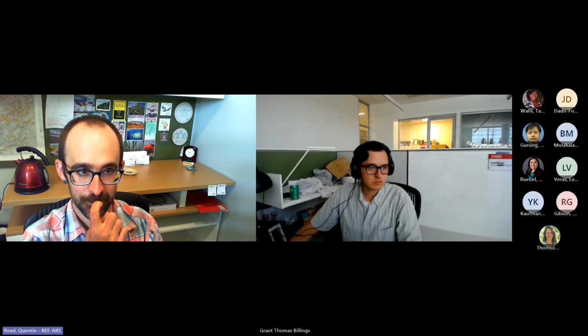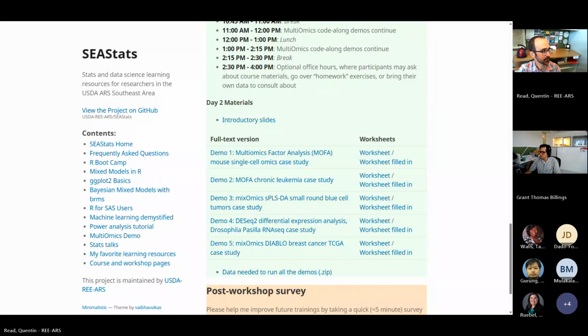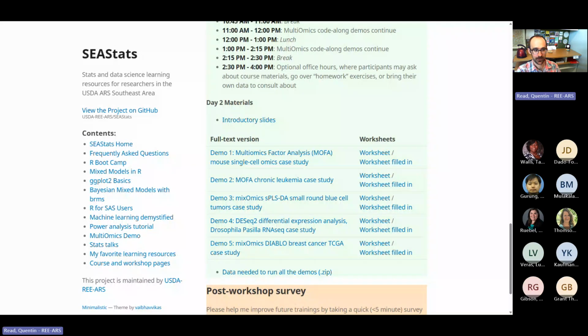So before we have a longer break, I'm going to do the third of the 5 demos, which is looking at the supervised method, partial least squares analysis, to look at a different example data set. So I'm going to go back to screen share here. Okay, so I'm back on the course web page, and I'm going to open up the course materials for the third of the 5 demos. We're just going to skip number 2 for now.